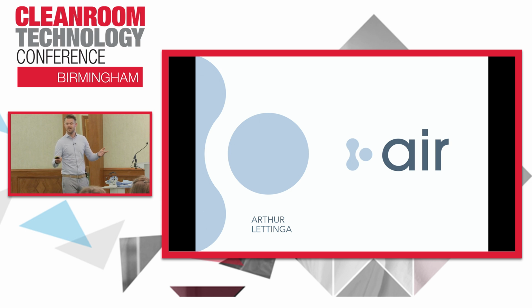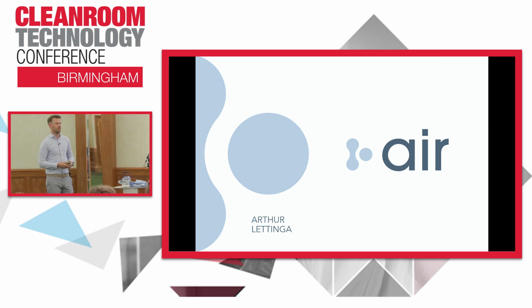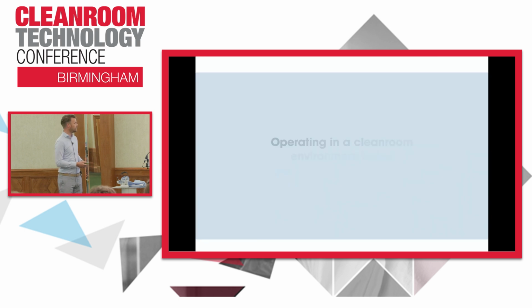Who in this room has actually been in a full gown, so coverall and mouth mask and everything? Quite a bit, by the way. Okay. So you probably know that it's quite a challenge, or at least if I speak for myself, I find it quite a challenge. So really respect for the people who are executing such a job. But this is about CO2, and CO2 is basically piling up in these types of suits. So that's the reason why we are standing here. But before I continue my presentation, I would just like to show you a video.